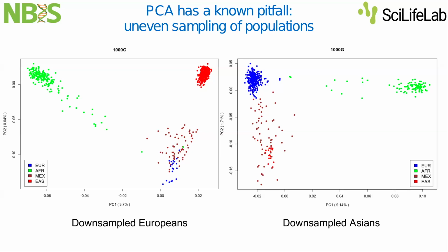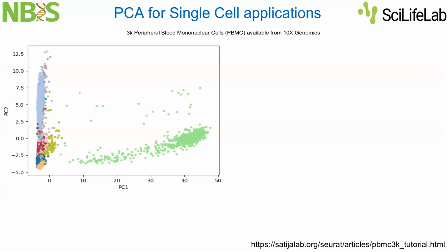Sorry, two principal components are absolutely not a good representation of your original data. But typically in pop gen, at least, people don't look at more than two or three components, and there is a good reason for this: we can't visualize five principal components in a good way. So an additional problem here is that you are looking at two principal components only. But I was going to come to this in one slide.